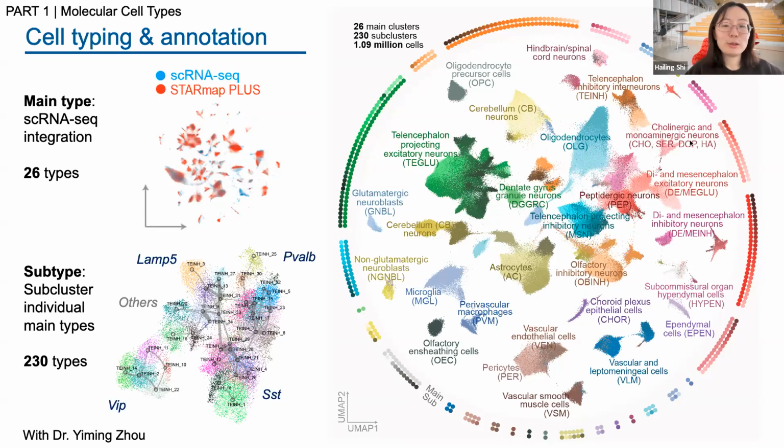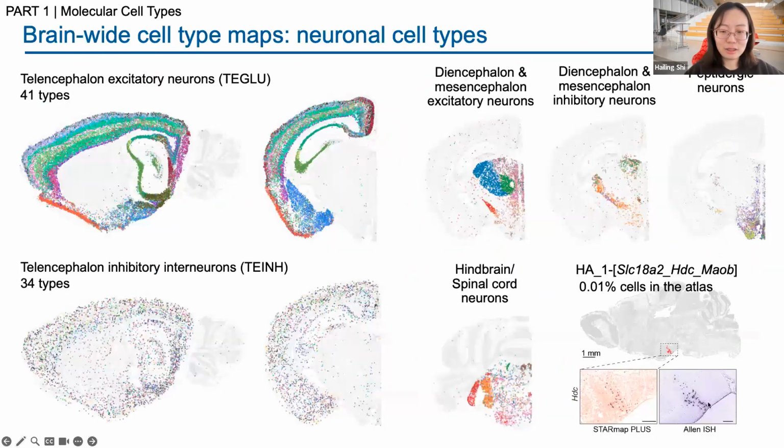Yeah, so it's actually a very satisfactory process when we finally see all the cell types come together. And it's also like the case where we first saw that histaminergic neuronal cell type marker was also positive for blood vessels. We once thought there might be some issue with the cell segmentation, but when we looked into the literature, it is indeed a specific cell type in that specific brain region that has that marker expression. So it's a lot of fun to learn about the real cell types appearing here and there in the brain structures. So this one I was talking about. Yeah. Cool.